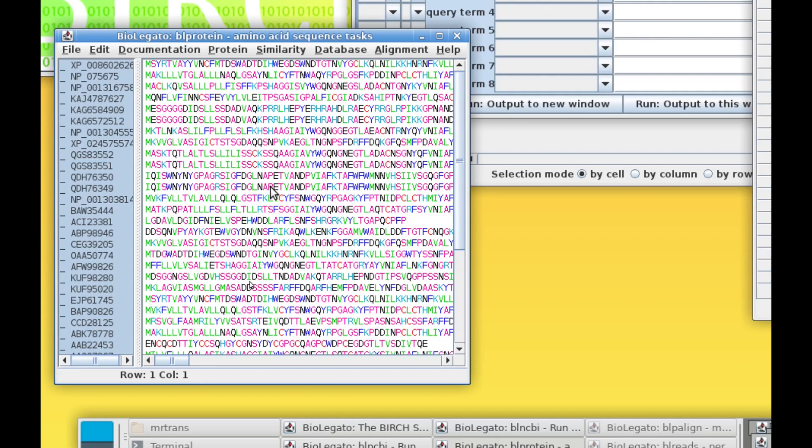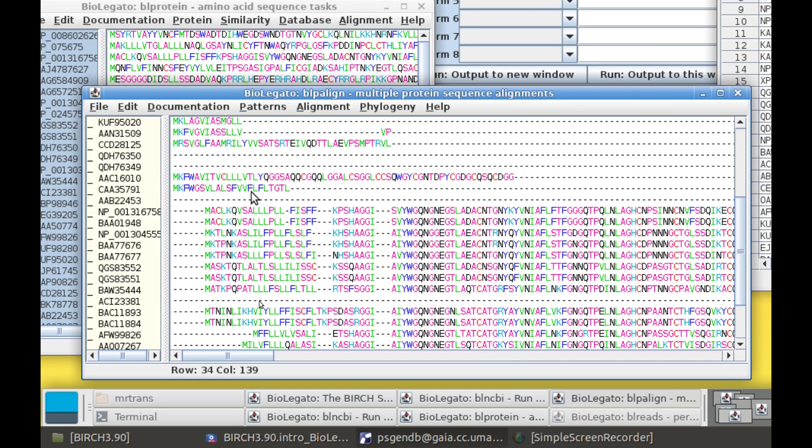In a typical workflow, the next step might be to do a multiple sequence alignment of the proteins we've retrieved. Output would appear in BLP-align, a BioLegato application specifically for working with multiple sequence alignments.